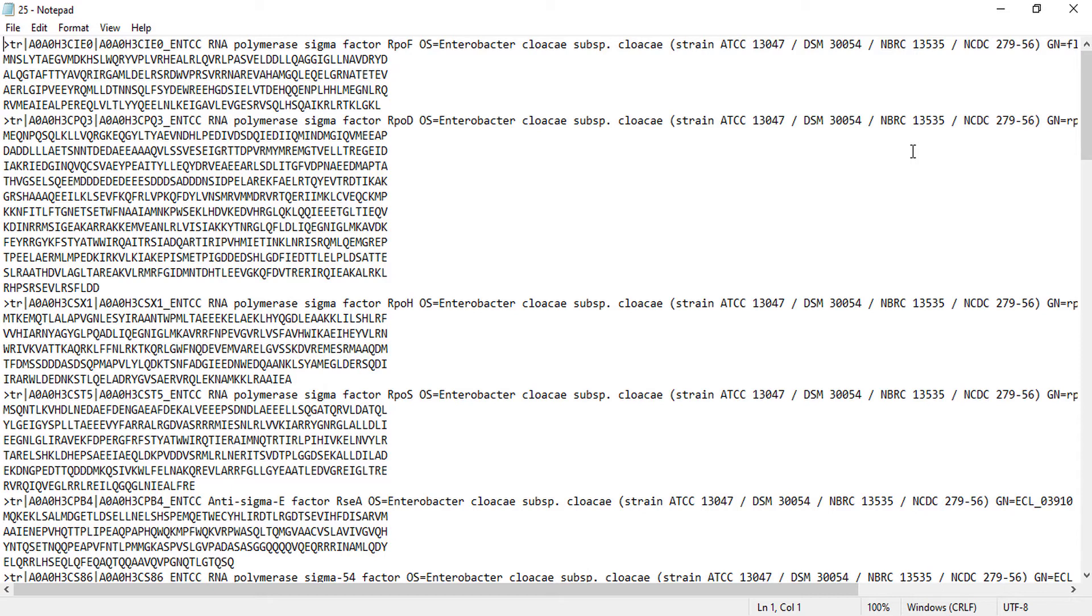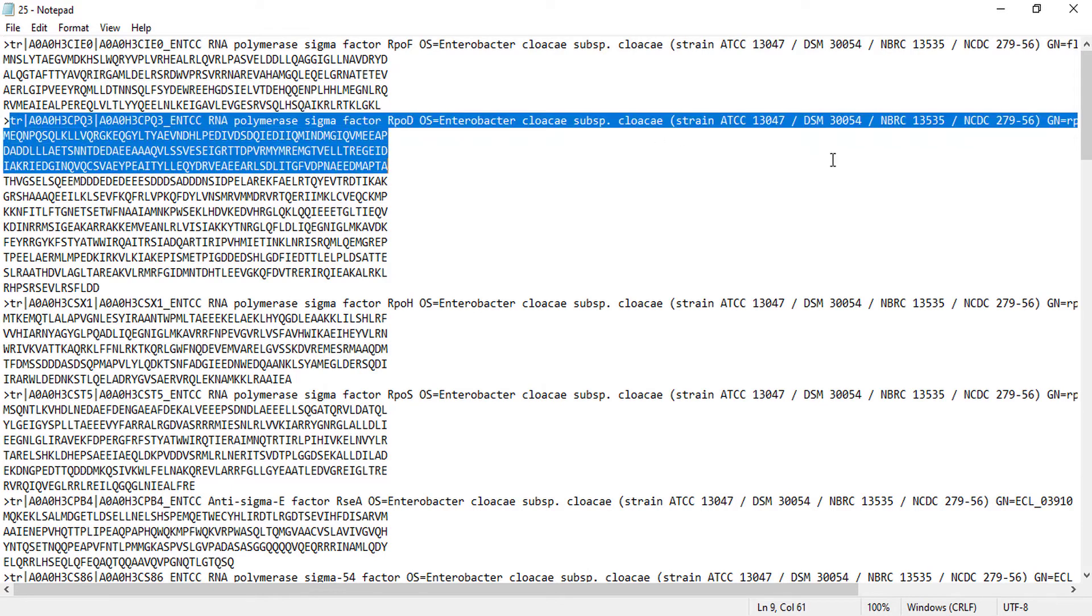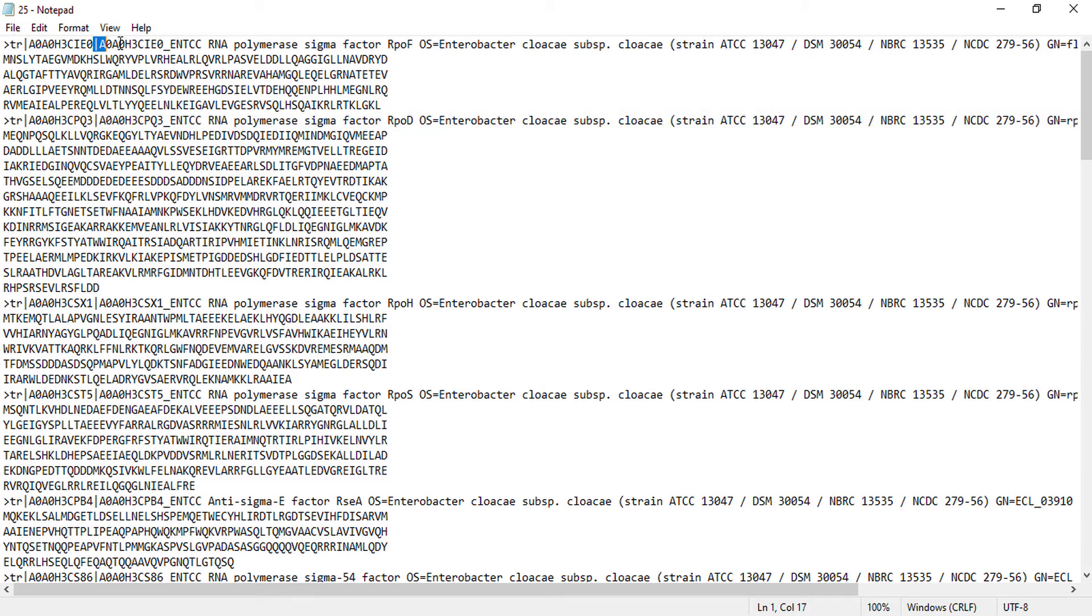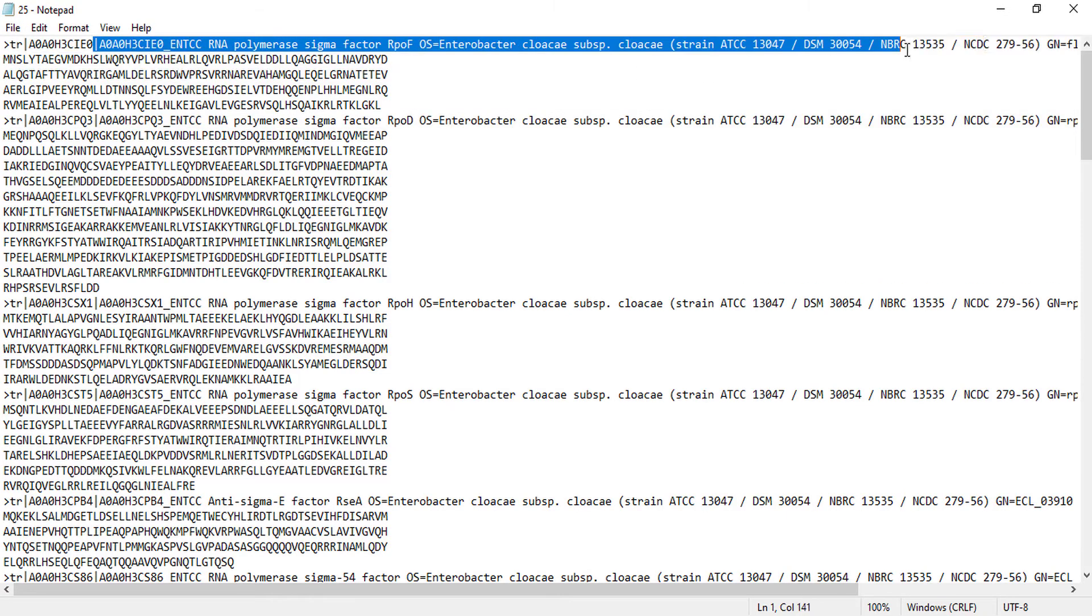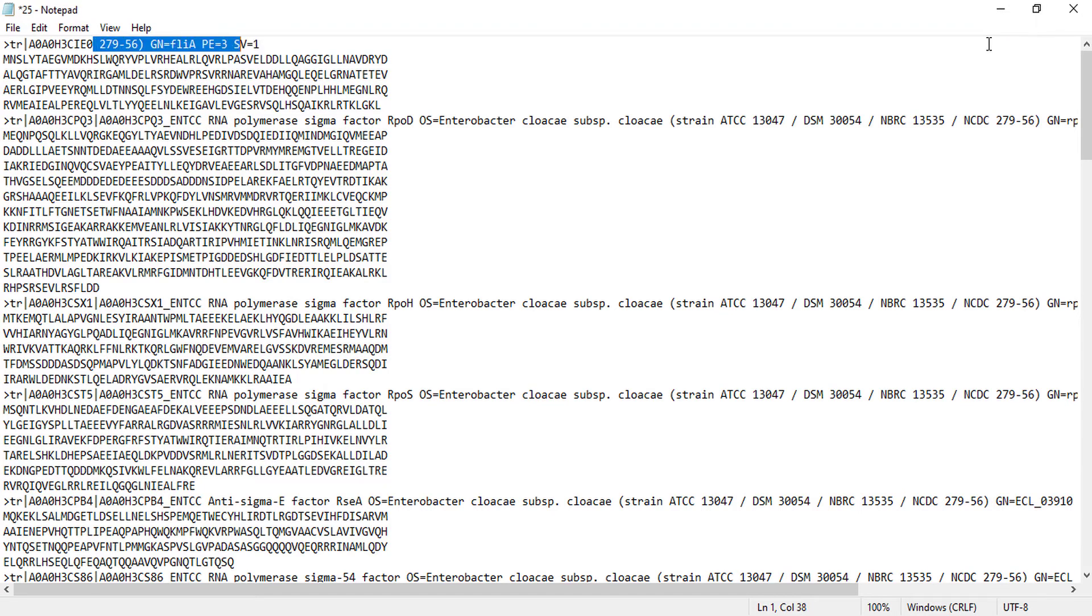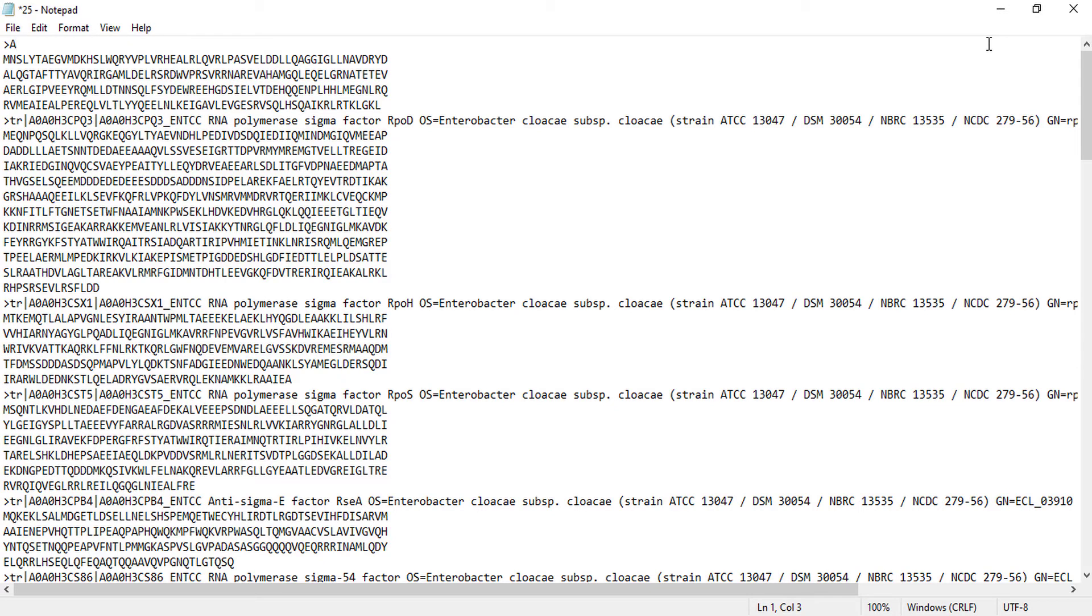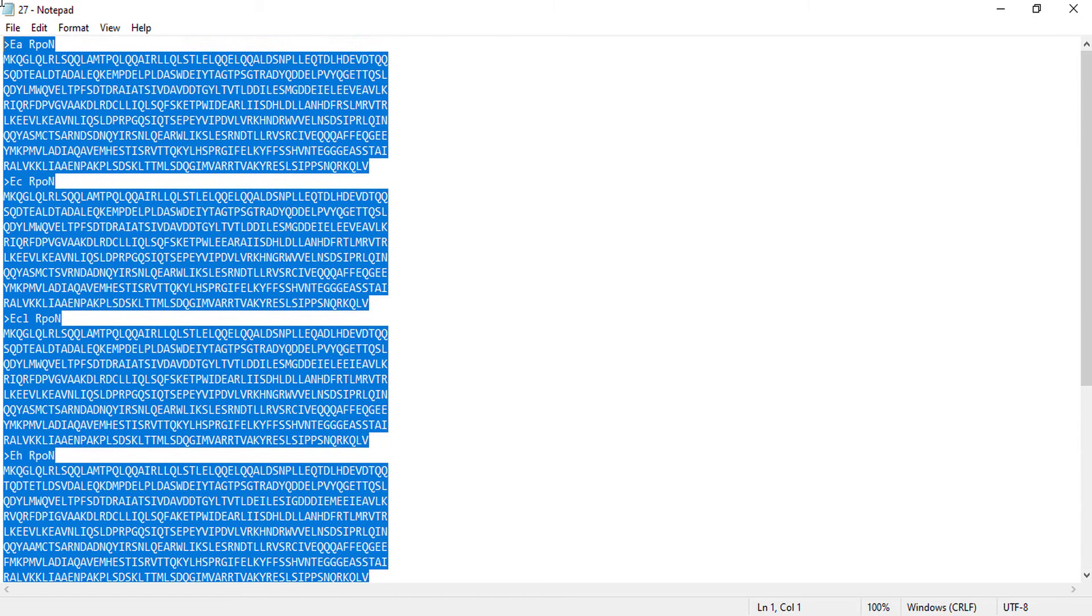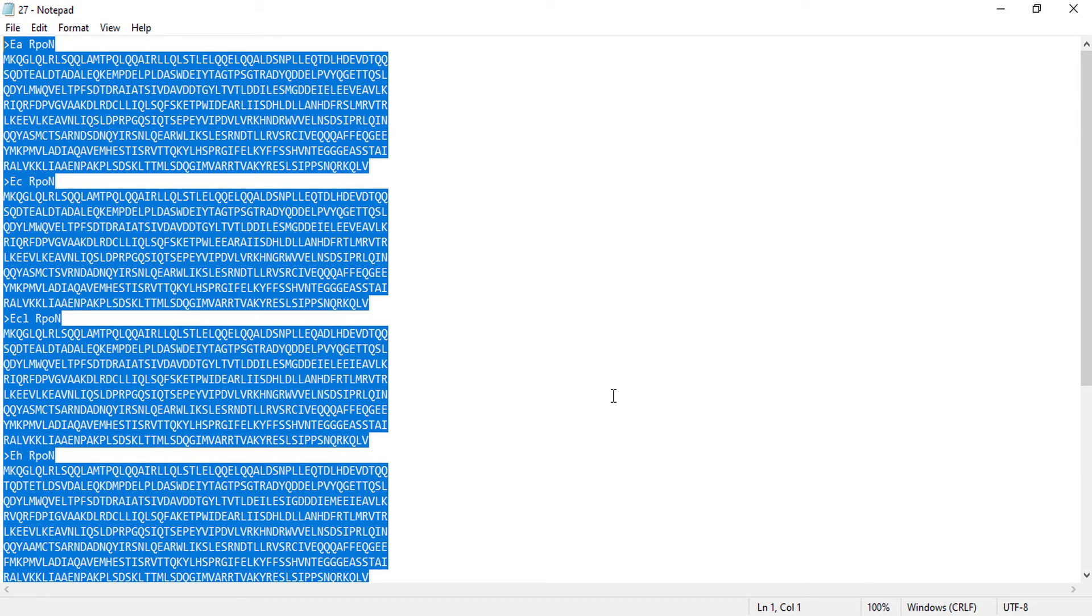But first we have to refine our sequence. We don't need this long description of the protein here. We only need the protein sequence. To refine a sequence description, we have to delete unnecessary details. One thing we can do is use only the protein ID if we want, or we can specify proteins by alphabets A, B, or C, or 1, 2, 3 as we want. I have only used a strain name as it was a bacterial sequence. I will use only these proteins to construct a phylogenetic tree.